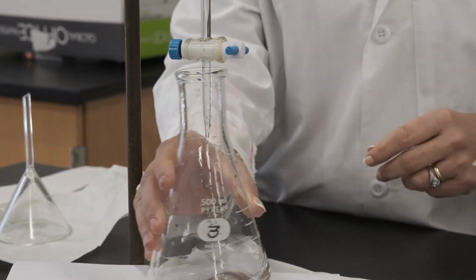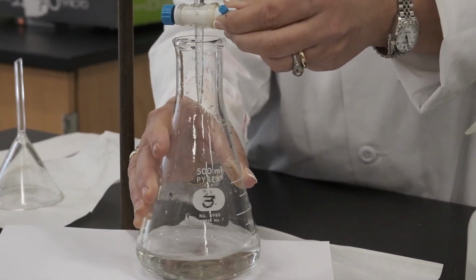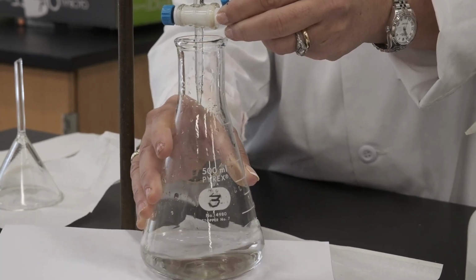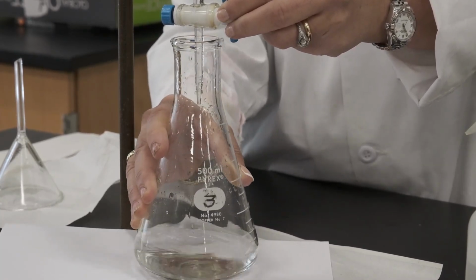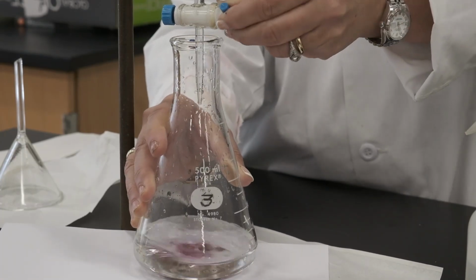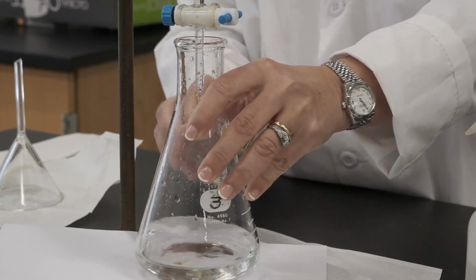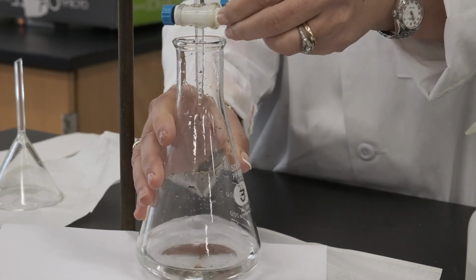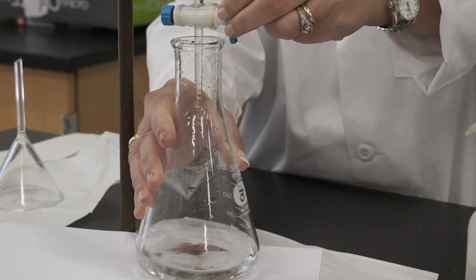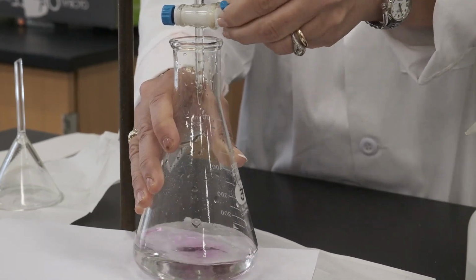When you're adding the sodium hydroxide, you're going to stir the solution with one hand and add the sodium hydroxide with the other hand, so that when you reach the end point, you can stop the titration immediately. When you see that the pink becomes persistent, you're very close to the equivalence point, actually to the end point of your titration. So one hand on the flask and the other hand on the stopper of the burette.